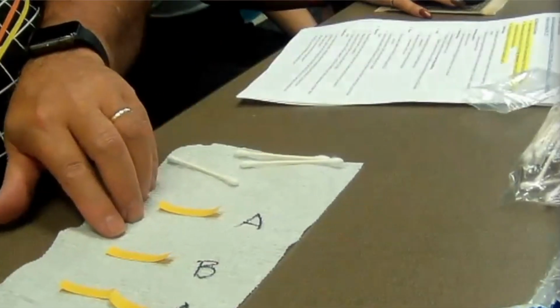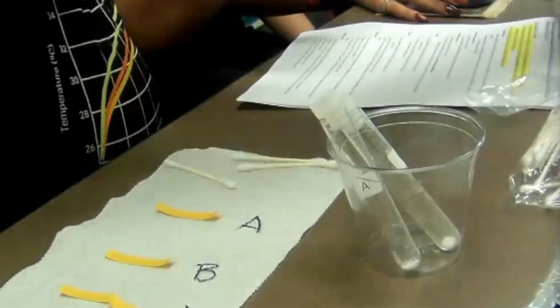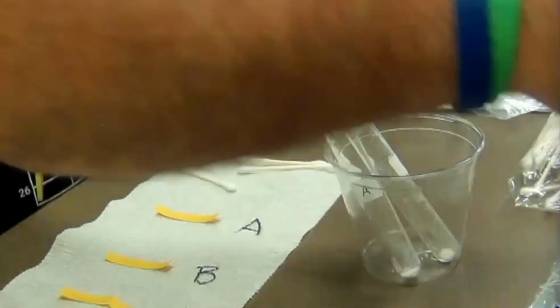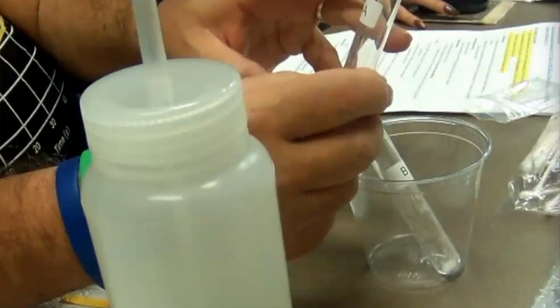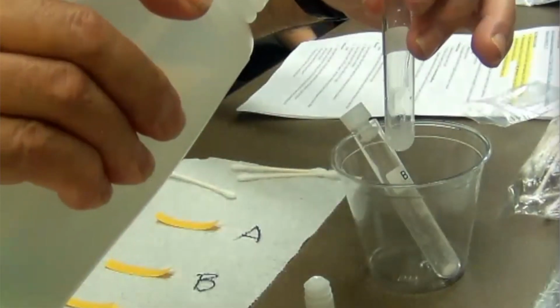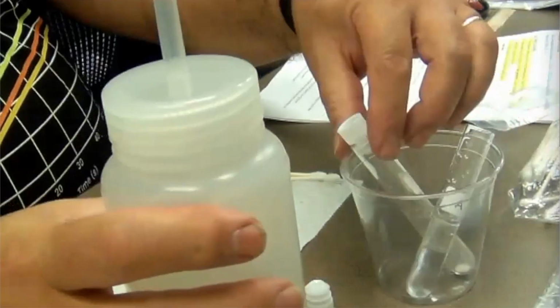Okay. And then the other thing to do is we need to fill the test tube. So you'll have a couple of wash bottles. Your kit will come with 2 of these wash bottles. You will need to put water in them when you get into the classroom. And what you need to do is fill the test tubes not quite to the middle, because eventually you're going to mix these. And so don't overfill them. Somewhere a little bit less than half. So you're going to put about maybe a third. So leave a little space.